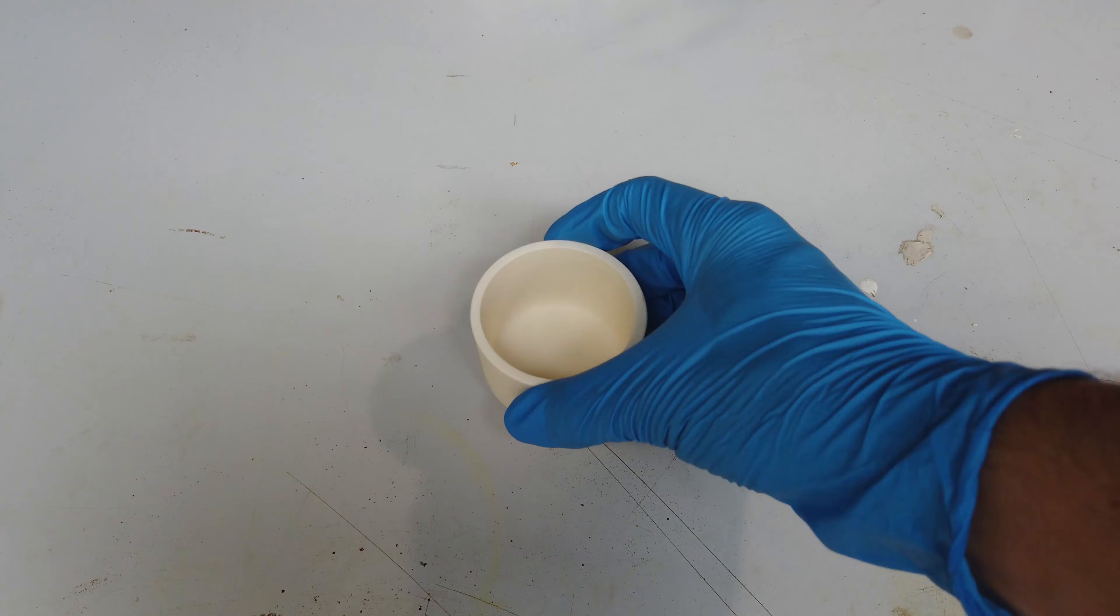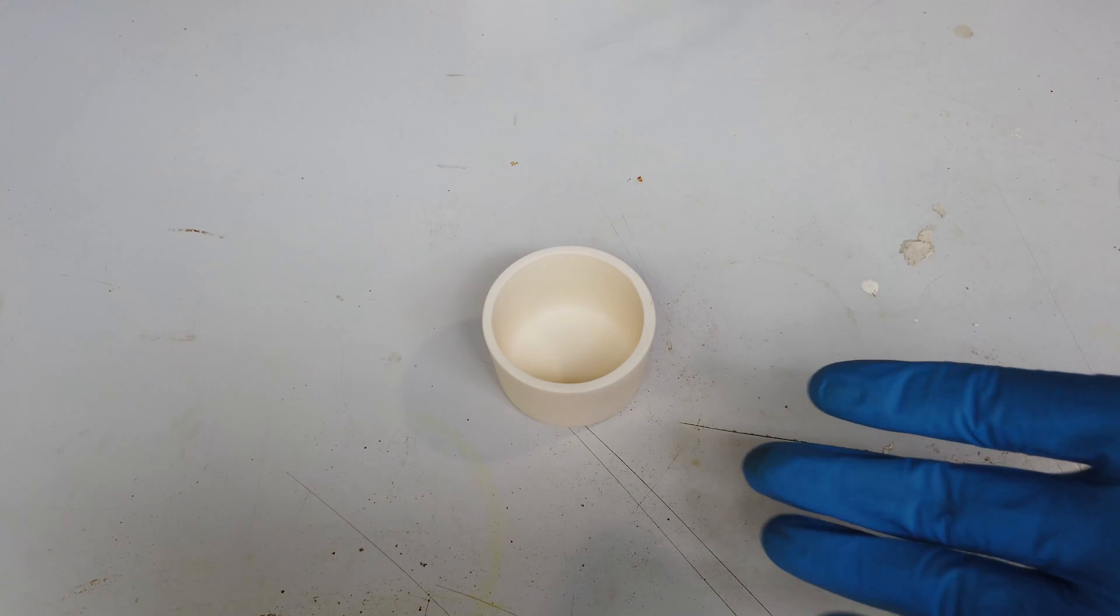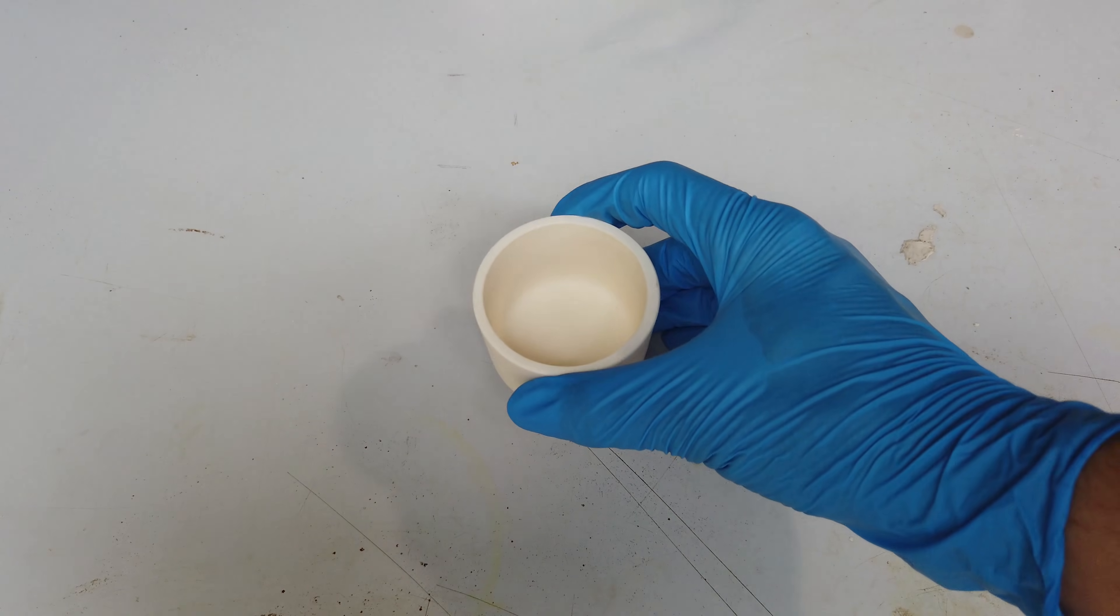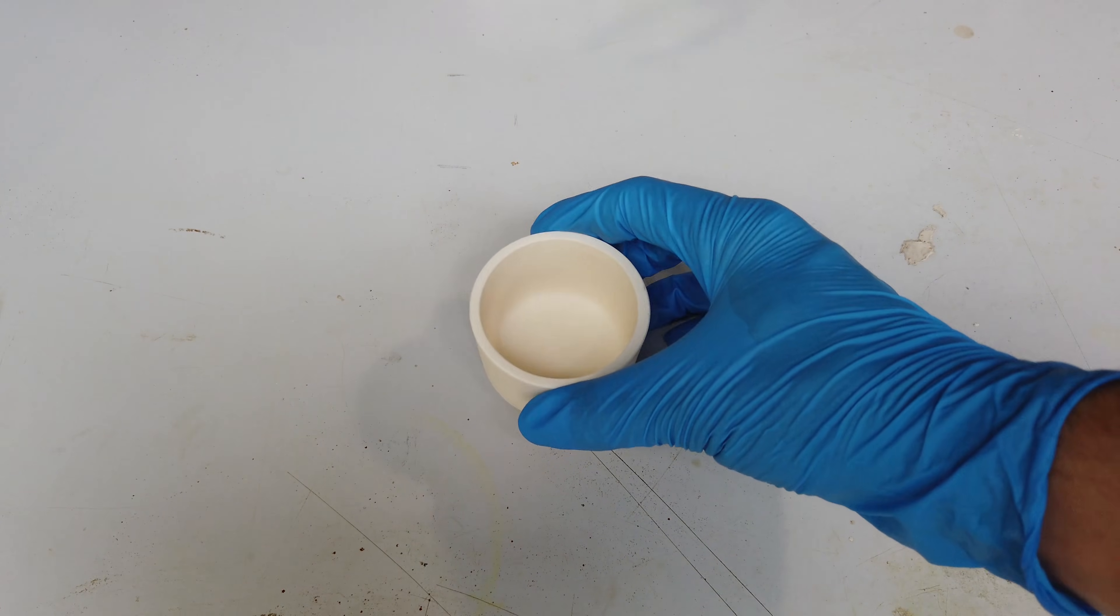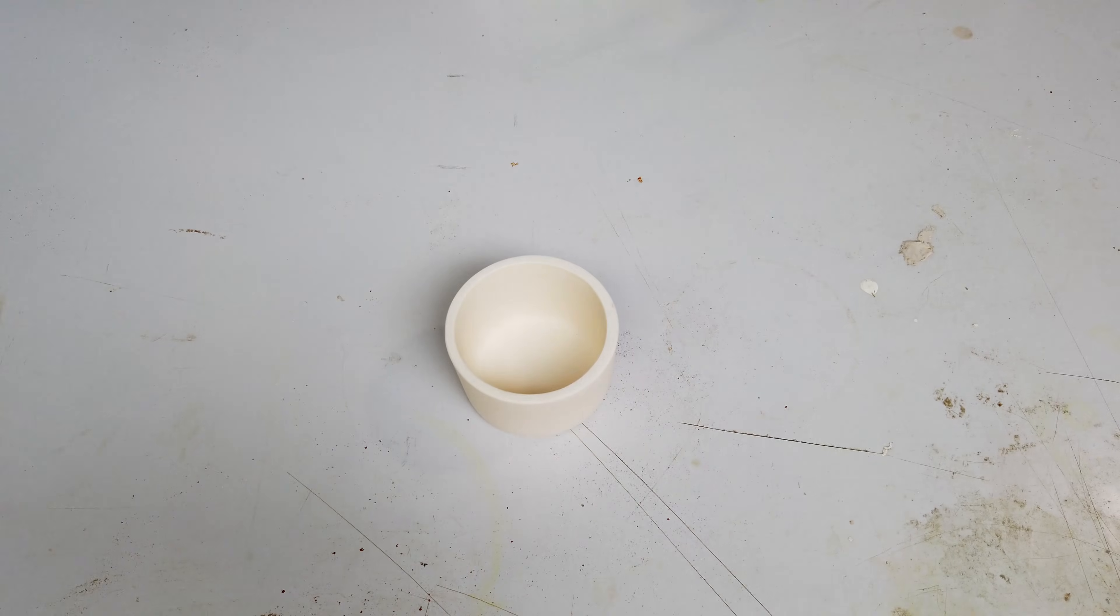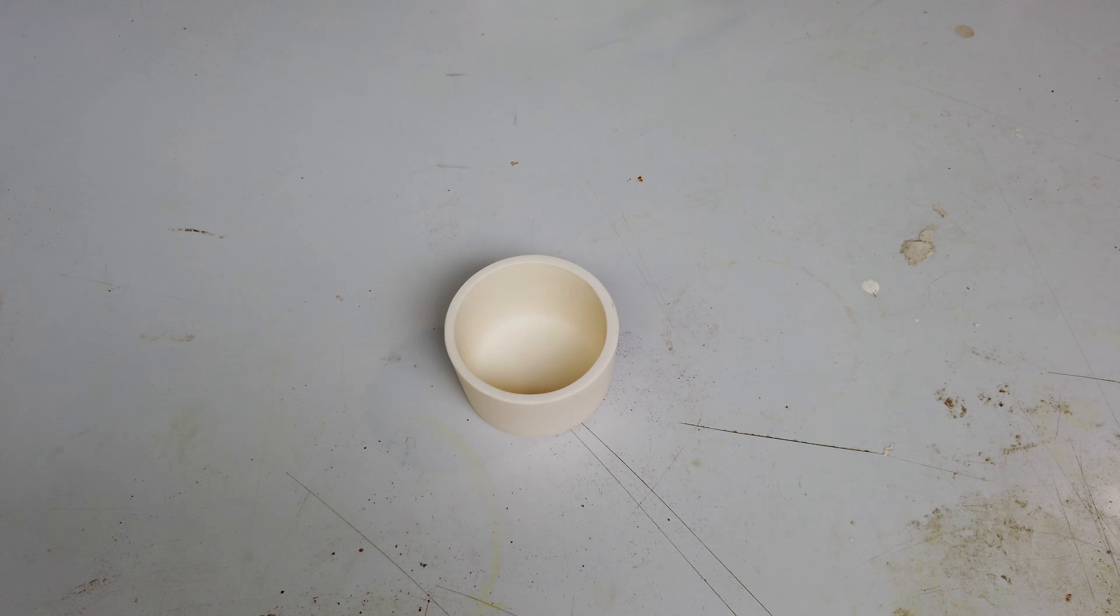Now with the lithium and alkali metal maintenance all done, we're getting into the thing that I really wanted to show you this video, and that's a new piece of labware that I got. It may look like just an ordinary crucible, and I guess technically it is, but this is special in the fact that this is a magnesia crucible. So this is a crucible that is 100% magnesium oxide.